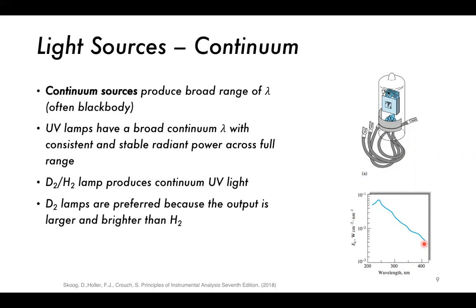It does that consistently, and that consistency is useful because it allows our instrument to know that and respond to it, so that it can correct for that lamp-induced error. So it can try and create a consistent spectrum. It might amplify certain parts of the spectrum so that it's not being manipulated by these changes in intensity. Sometimes it's not necessarily necessary, but it depends on the system. But your instrument is usually capable of doing that, especially modern instruments.